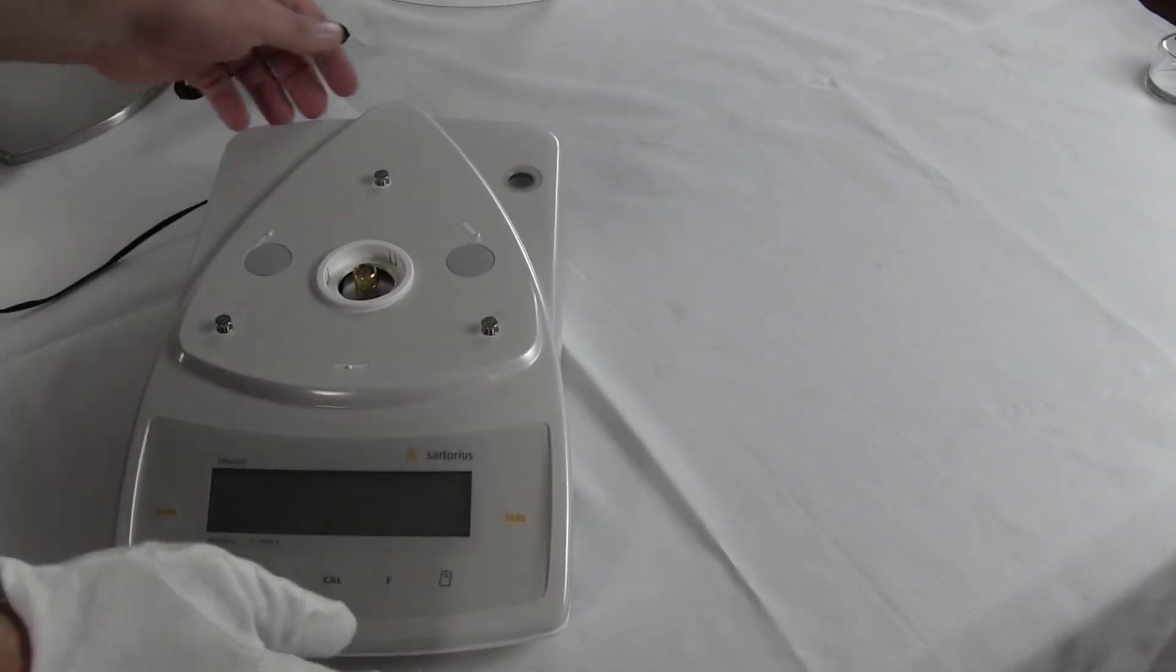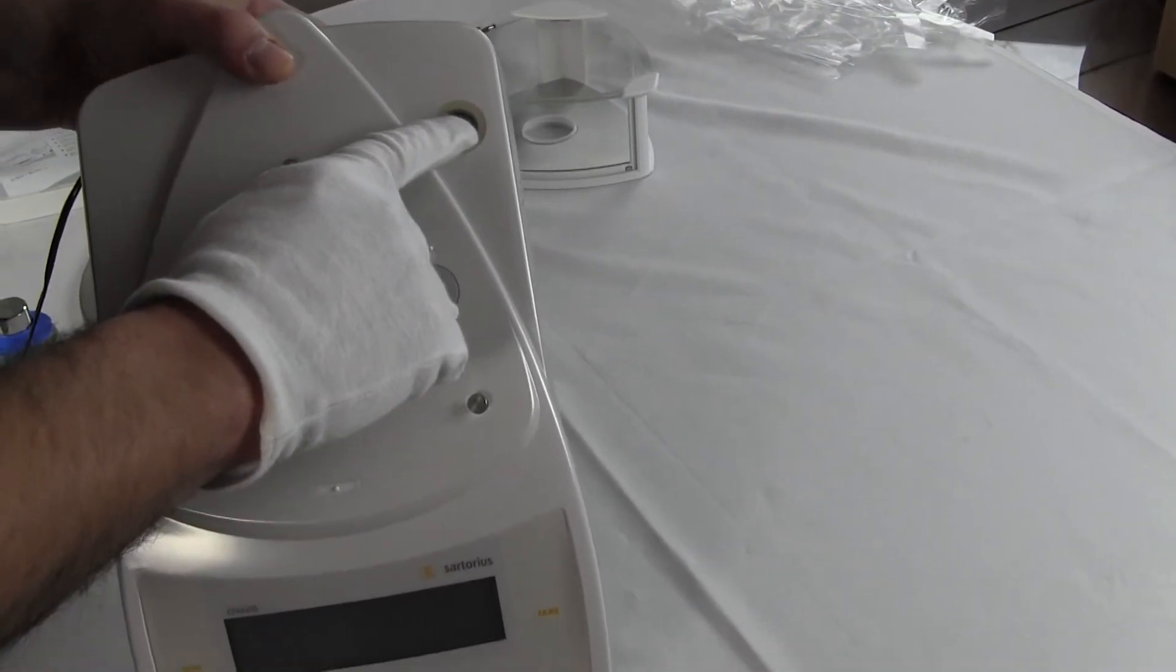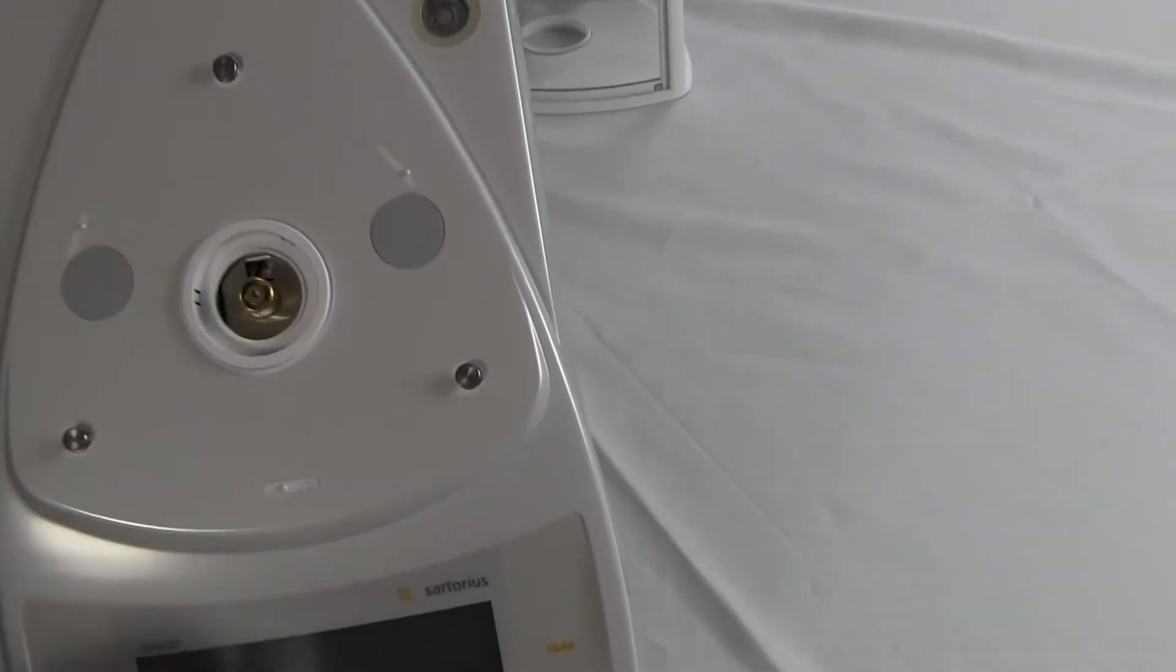Getting back to the balance itself, you'll notice in the top right-hand corner, we have a spirit bubble. This is for adjusting the balance to make sure it's level. Your balance always should be level.